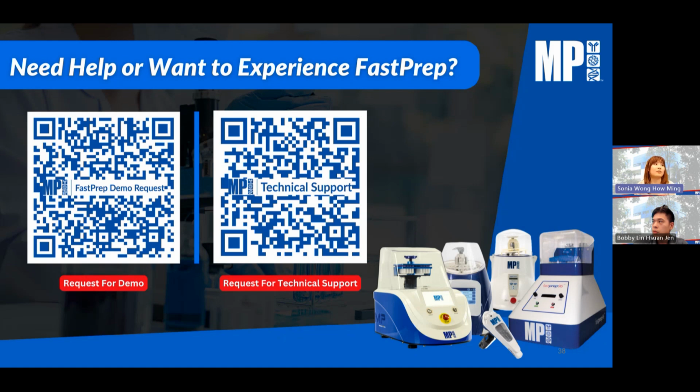Definitely in this case, if you are concerned about the extraction efficiency or enzyme degradation, you would probably want to go for a medium speed, and then maybe 1 minute, and then put it to rest in between, and then you do another cycle. If you do not get enough yield or enough enzyme yet, then only increase the cycles progressively. That will probably help with your optimization work in dealing with this fungi.